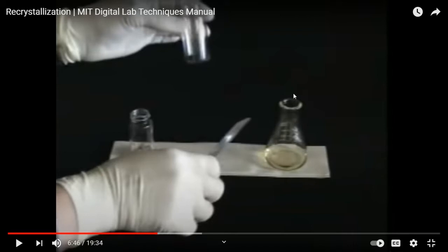So when you try to put this thing into these openings, because of the draft, the wind from the bottom, the charcoal is just going to scatter into the water, and that's dangerous. That's why we need to cool down a bit. I told you it should not be cooled in the ice bath. Okay? It should not. Just under.